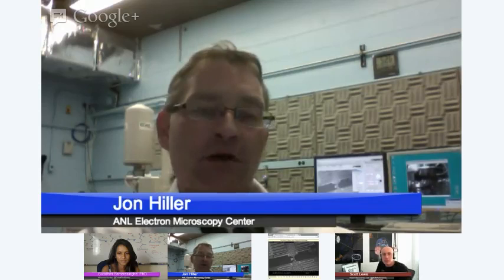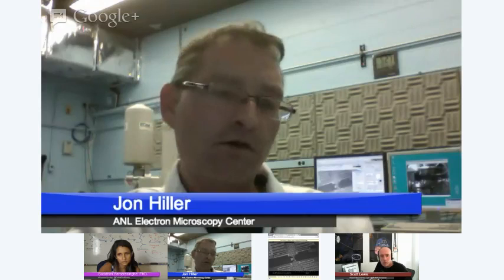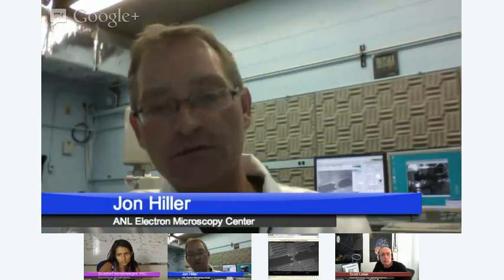No, it's really awesome. Just think about the different implications and different ways that this technology is used. How long has electron microscopy been around that we've been using it in modern science? Yeah, I mean, it's fairly old. So the first electron microscopes were built in Germany in the 1930s, I believe. Oh, wow, okay. The scanning electron microscope, like this one here, has been around since the 60s. And they've been around for a while, but they just keep being improved upon. You know, the resolution of these microscopes just keeps getting better and better and better.